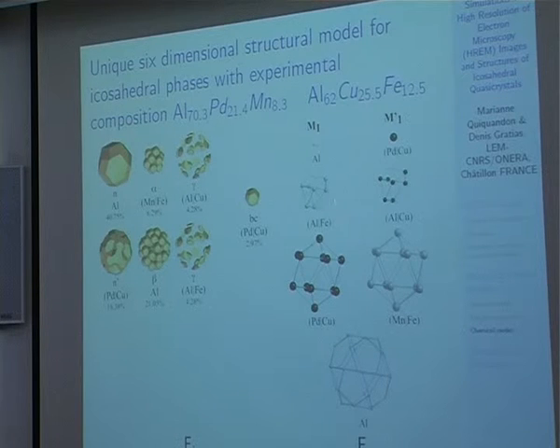in the physical space. In this space, there are only 2 different chemical configurations for the MM prime cluster, and 1 configuration with 82% of partition. And here we have also B and B prime clusters, and we have only 9 different configurations for the B and B prime clusters. B prime clusters are clusters close to the Bergman clusters.